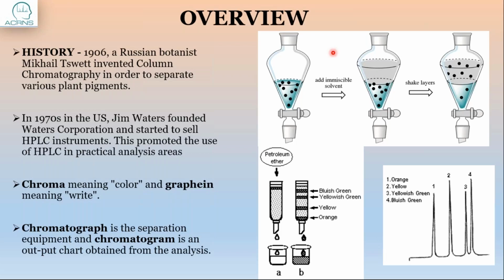On this slide, we are going to see an overview of chromatographic techniques, the separation tools which were used over the centuries. The initial tools used to separate different components included the separating funnel, which we see here in this particular slide.